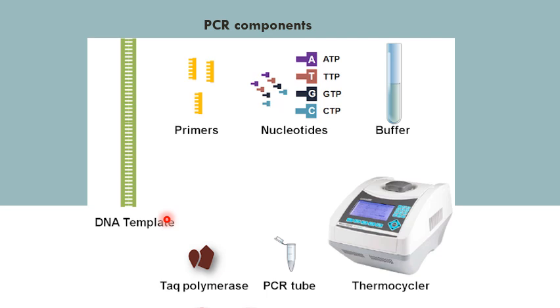And for example, for sure, you need the Taq polymerase. All of the assay is working based on the efficiency of this enzyme, the polymerase enzyme. It's high fidelity, it's thermostable. All the characteristics presented in the DNA polymerase will be reflected in your assay.